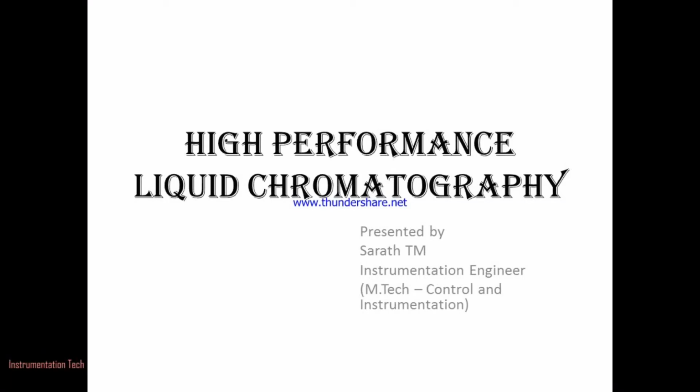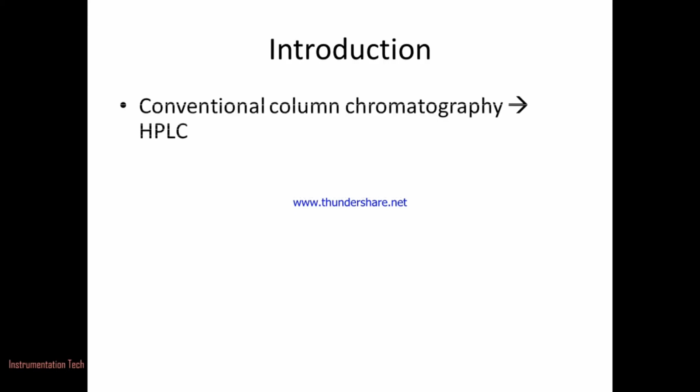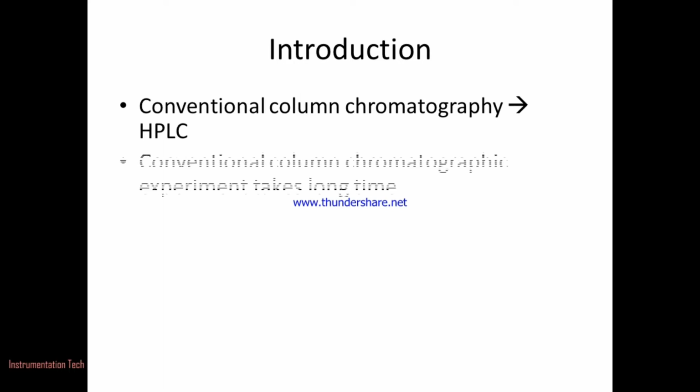Hi, in this video I am going to explain about high performance liquid chromatography. Introduction. High performance liquid chromatography is a product of the scientific effort towards optimization of the conventional column chromatography.